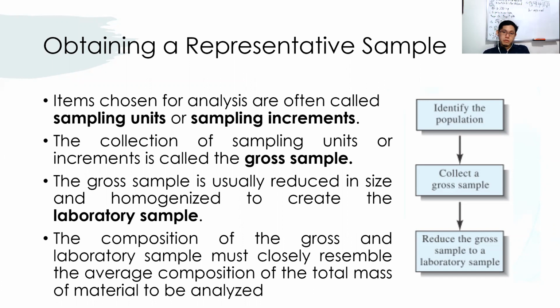So kapag liquid yan, madali yan kasi pag nasama-samahin mo na yung liquid and then hayaan mo lang siyang naturally mag-homogenize. Pero pagka solids, kailangan mo pa ng further processing which usually involves drying and then grinding to a powder or to another homogeneous form.